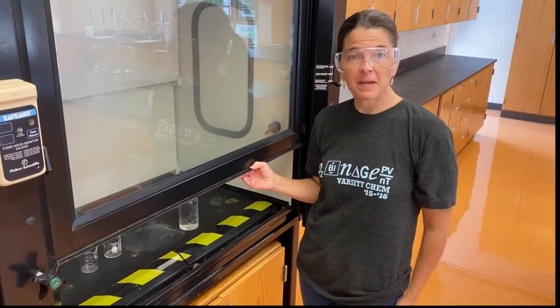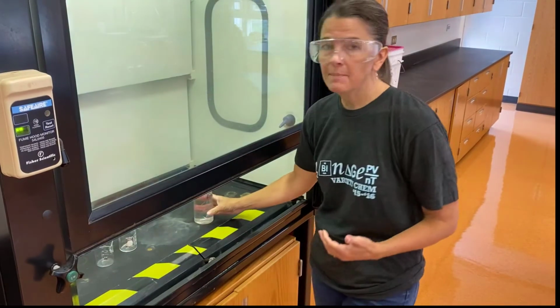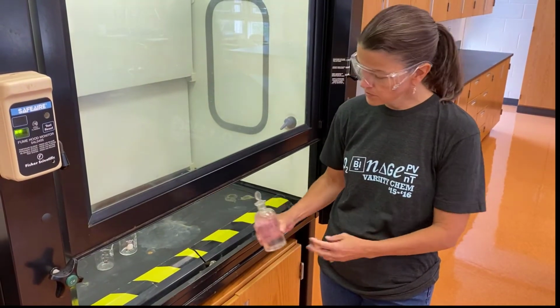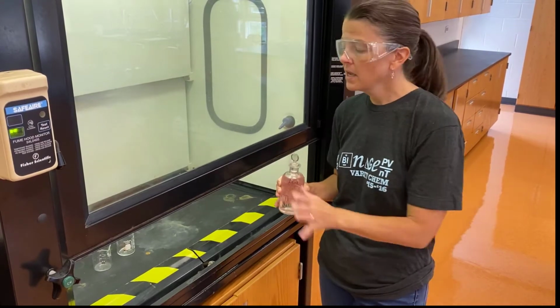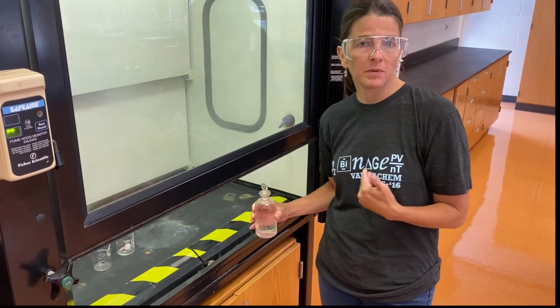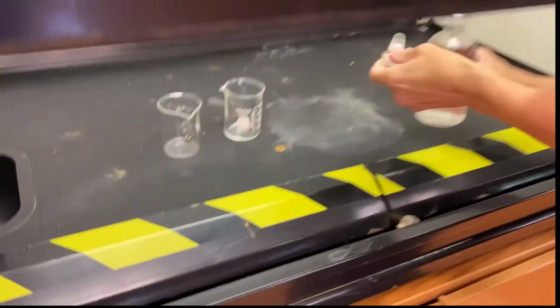So now that we have the masses of our zinc copper mixtures, I'm going to do the next step in the fume hood because we're going to use concentrated nitric acid, which itself has some nasty fumes, and we're going to be producing a gas that we don't want to breathe. So we're going to add it in here, and you should be able to see the reaction.